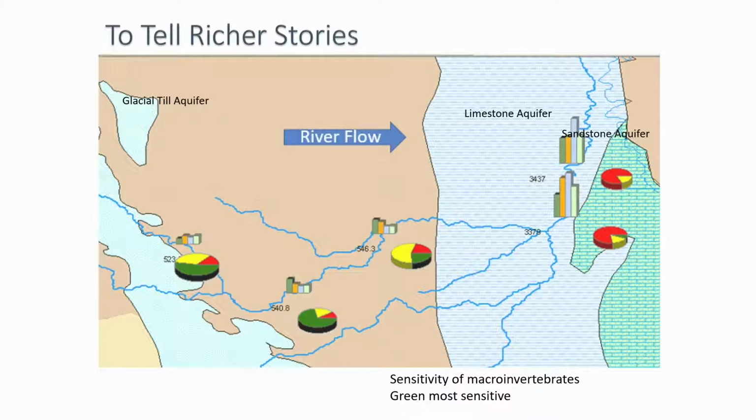Awesome. So you're able to go in and just pull maps of different types of data and lay it on top of the map of your data. And now you've got layer upon layer upon layer of data, some of which you collected, some of which somebody else collected, all of which can be combined to tell a story. Right, and so as your students realize that science is really a collaborative process, they can share what they measured, and they start to understand it has a meaning and it has significance.